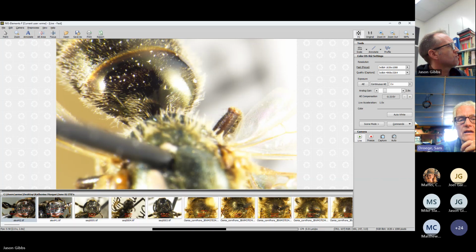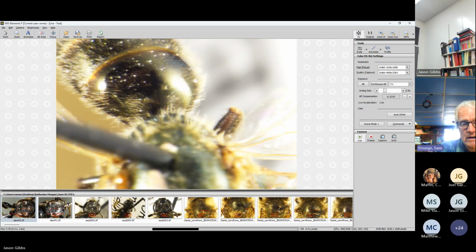The opening at the top tends to be smaller than the width of the hairs on the side, but not super tiny like levissimum, and certainly not complete.